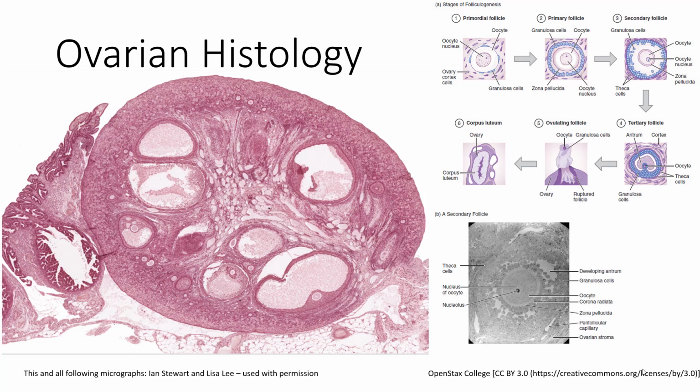In this video, we're not going to be learning so much about the general histology of the ovaries, although that's very good. Mostly what we need to know here is that the ovary, which you can see here on the left, is divided largely into a cortex and a medulla, like many spherical organs are. And the germinal epithelium is out here in the cortex. And then the medulla is a highly vascularized loose connective tissue that's the primary trophic center. That's about all we're going to say about the general histology of the ovary.